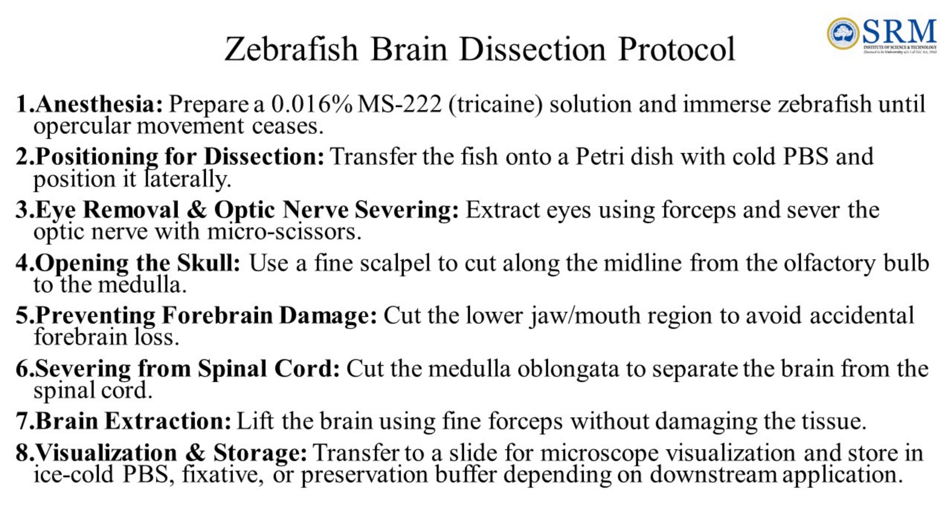Step 6, severing from the spinal cord: cut the medulla oblongata to separate the brain from the spinal cord. Step 7, brain extraction: lift the brain using the forceps without damaging the tissue. Step 8, visualization and storage: transfer the dissected brain onto a slide for microscope visualization and store it in ice cold PBS.